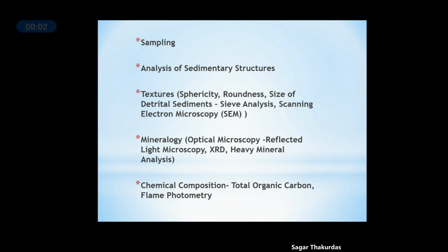So if you go stepwise, the first step is sampling or collecting the samples in the field. In sedimentary petrology, or especially sedimentology, if you have samples containing certain sedimentary structures, then you go for the analysis of these sedimentary structures.